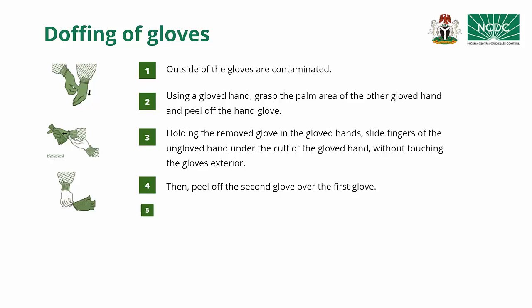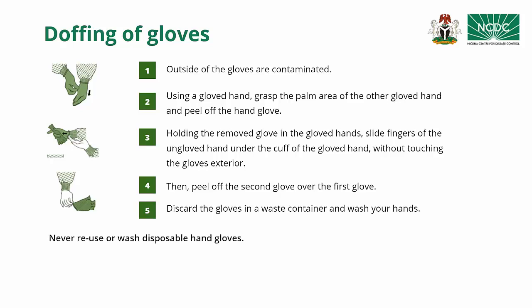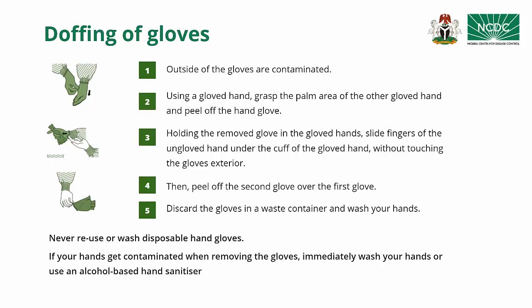Discard the gloves in a waste container and wash your hands. You must never reuse disposable hand gloves. Also, if your hands get contaminated when removing the gloves, immediately wash your hands or use an alcohol-based hand sanitizer.